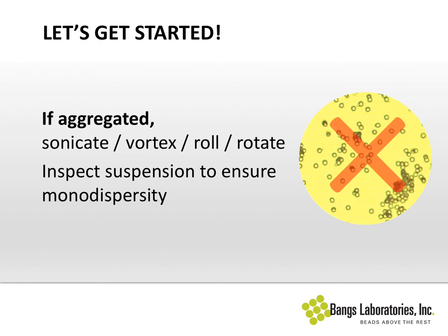If you're opening a fresh bottle of particles and it looks aggregated, it may mean that it froze in transit, in your receiving area, or maybe hit a cold spot in the refrigerator. Once polymer microspheres in particular — but other sorts of microparticles as well — once those suspensions freeze, it's nearly impossible to return the suspension to a monodispersed state. So it's very important to keep particles from situations where they could freeze. If you've had a suspension that hasn't frozen but you've had it in storage for a while and you're seeing some aggregation, it's likely just that particles settled over time or some surfactant migrated to coat the walls of the bottle — a transitory aggregation you can easily treat with sonication or just a couple of hours of rolling.